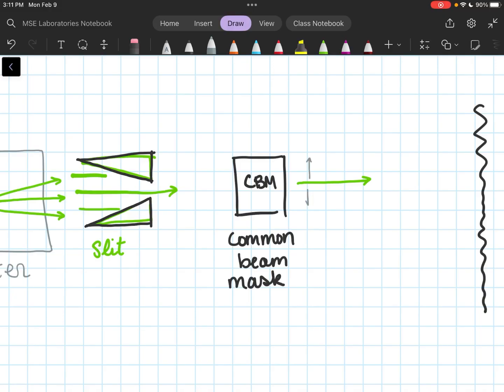Because that is its name. Does it hide something? It doesn't. It actually is a height adjustment. So it's going to take the light that comes out of these slits and adjust it to make sure that it is perfectly aligned to go through the next line of things. I don't know why. That's just how it is.